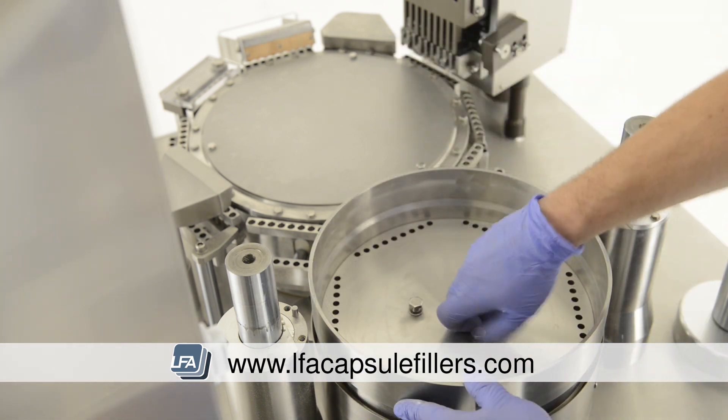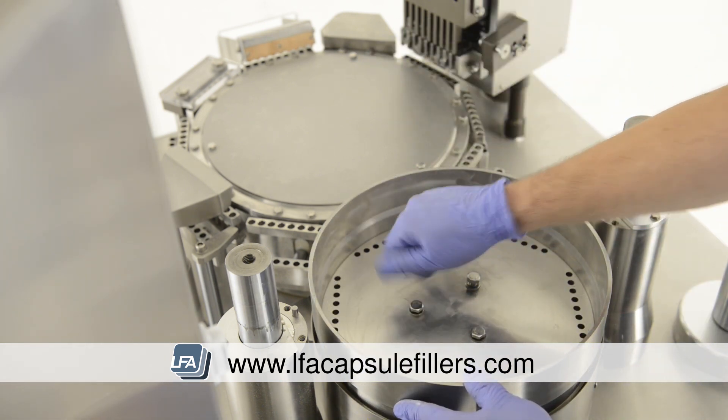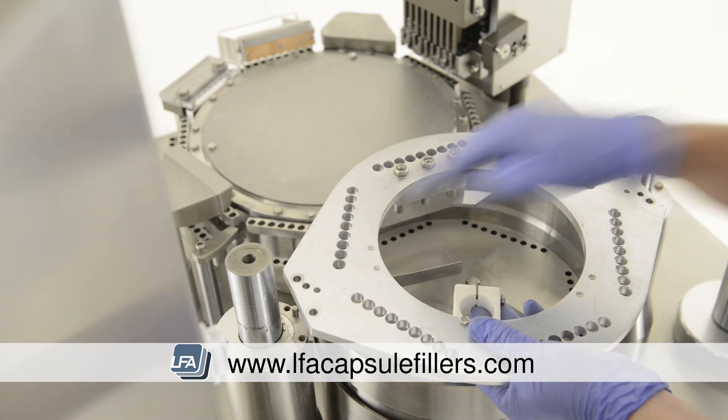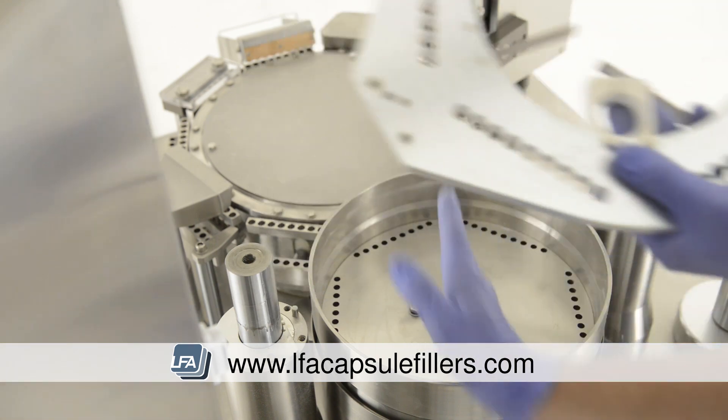Now we start building the tamping turret back up. Start with the bottom section, reinsert the three bolts and tighten but leave room so there's still play and we can still adjust it. When replacing the next plate, ensure the sensor holder is in the outward facing position.